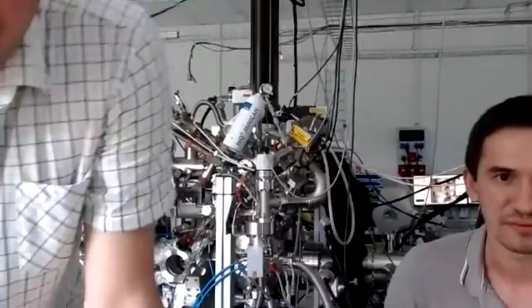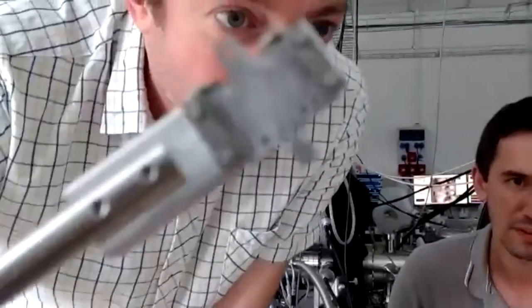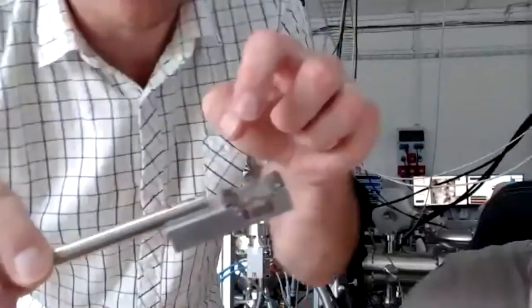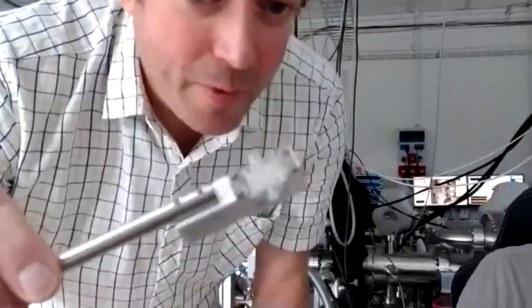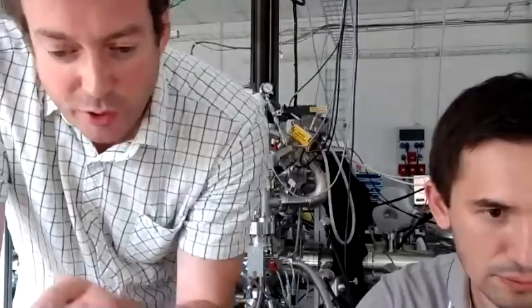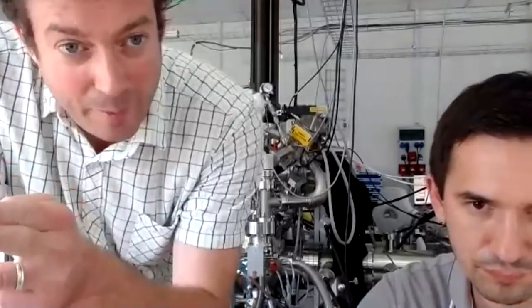Just to technically show you, here's a sample holder we usually use. It's a standard from SPECS. You can see those 4 holes, where a piece of metal with holes as well can be screwed on, and you can put a sample on that. Or, as Misha mentioned, if the sample has a non-standard size, we can use stainless steel foil, cut stripes of the desired shape and size, and spot weld them directly on the stainless steel of the stage.